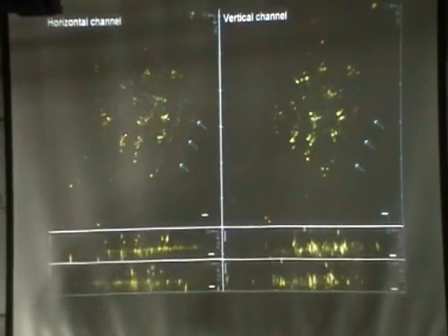And you can get images like this, one for the one polarization channel, one for the second channel, and this is XY, XZ, and YZ, and for the two channels. So you can get two 3D plots. And something we haven't done yet is to combine these two. That's not easy because you need to find the corresponding molecules. It's not an easy task. So each point here comes from a double helix, a double lobe spot, like that.